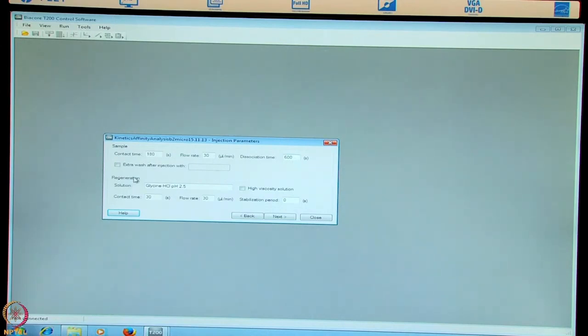Coming to the regeneration. The regeneration solution is glycine HCl pH 2.5 with a contact time of 30 seconds. Flow rate of 30 microliters per minute. Stabilization time of 0 seconds. And we now go on to the next tab.